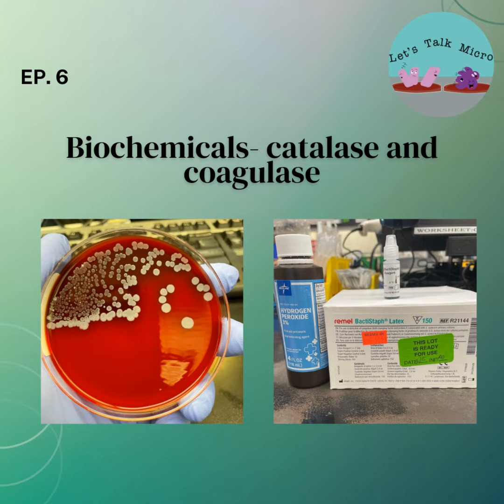You have to keep in mind that for a reaction to actually be called positive, it has to be a quick reaction, quick and strong. As soon as you add that drop or add the colony to the drop, you should see bubbles. And some of you students, some of you microbiologists out there already know where I'm going with this. Why should you see it immediately?